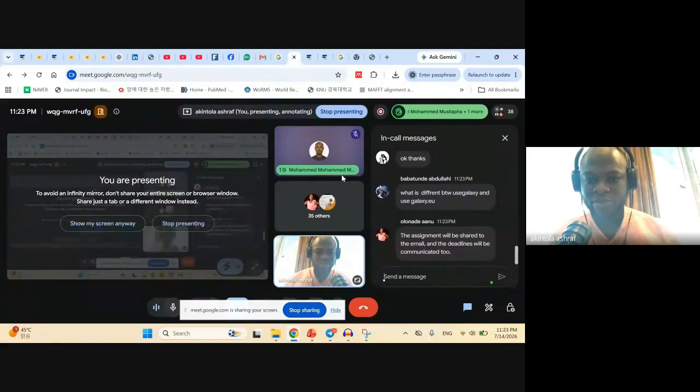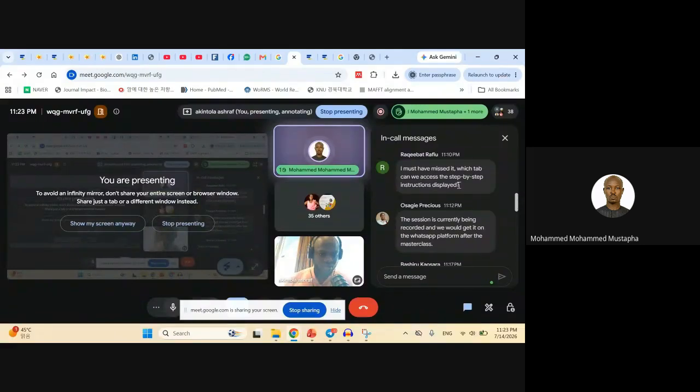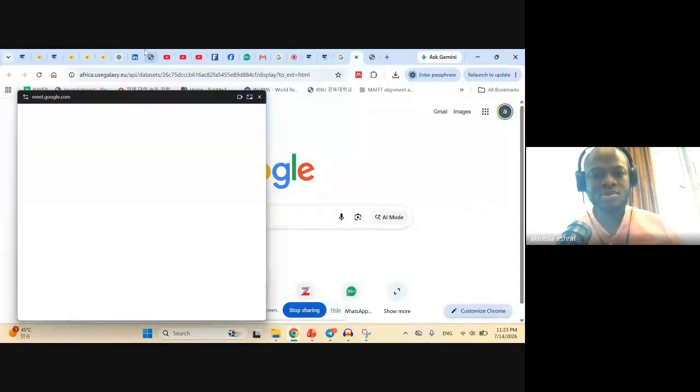Thank you very much for your wonderful presentation. I want to know what's the peculiar difference between NCBI and BLAST? NCBI is the website. BLAST is a tool on the NCBI website. So let me show you.